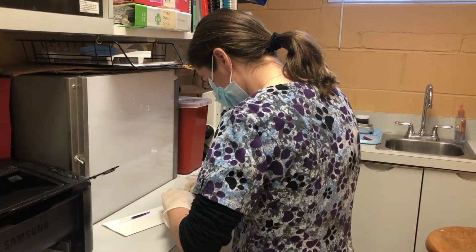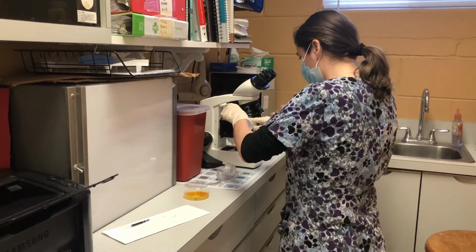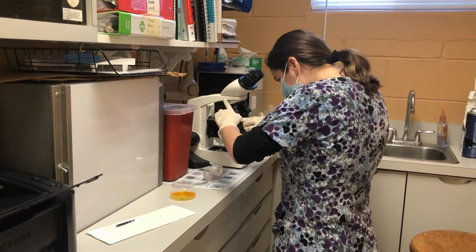So now that we have that, we're going to look at it under the microscope at low power, to see if we can see any spores.